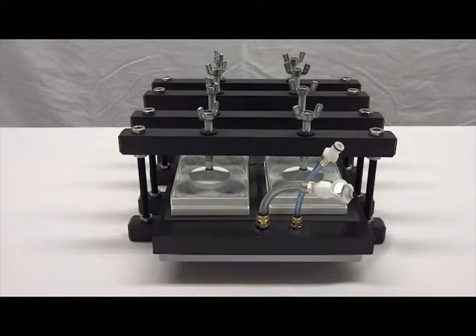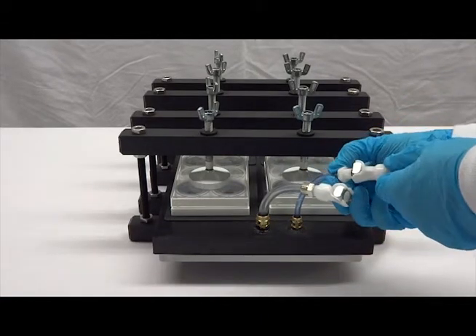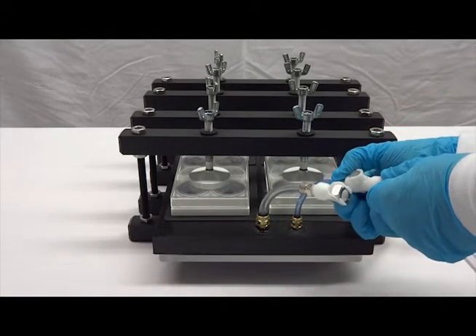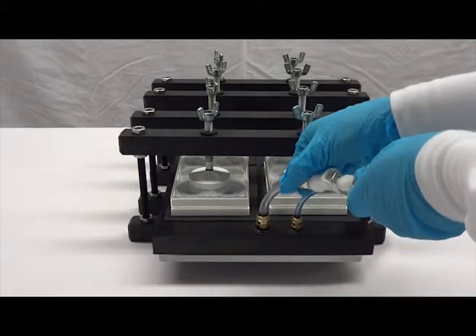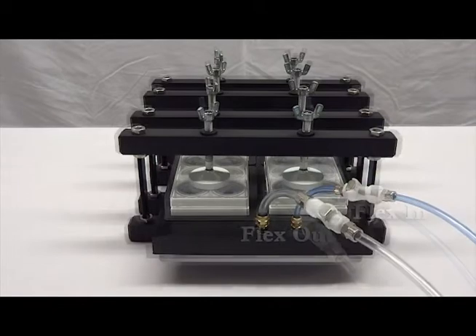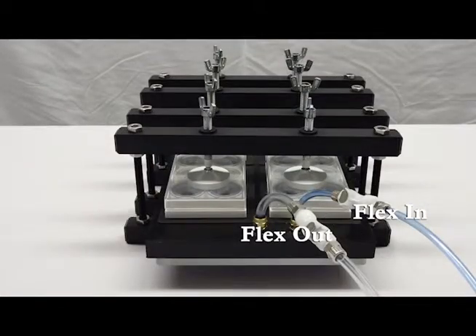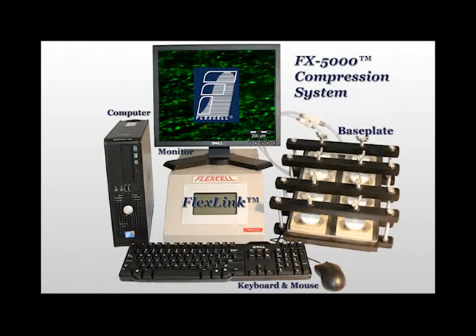Connect the FlexN tubing to the quick disconnect attached to the blue 1/4 inch or 6.4 millimeter tubing on the base plate. Connect the FlexN out tubing to the quick disconnect attached to the clear 3/8 inch or 9.5 millimeter tubing on the base plate. Your compression base plate is now ready for use.